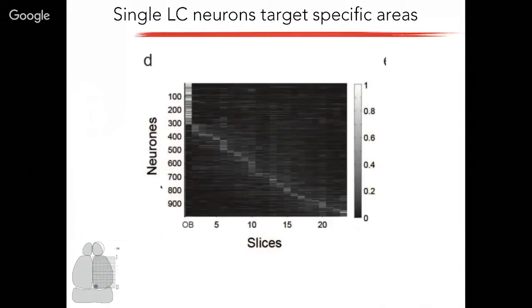So this is orders of magnitude more throughput for this system than has ever been. Well, I think there were no locus coeruleus single neuron reconstructions, so more than orders of magnitude is infinitely more. But in general, 1,000 neurons in a handful of experiments is high throughput.